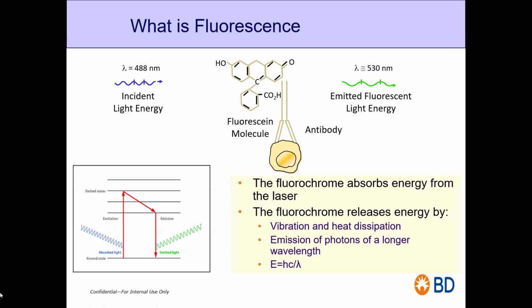Let's talk about a fluorochrome. The best example I would give you is, on roads, when you put the beam of your car light on those bright colored things, they give you some light. That is the fluorochrome. They are made up of fluorochromes. Same principle, we use it here.